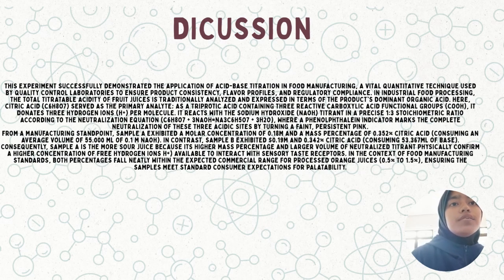This makes sample A a more sour juice because of its higher mass percentage and larger volume of neutralization, which confirms a higher concentration of free hydrogen ions.